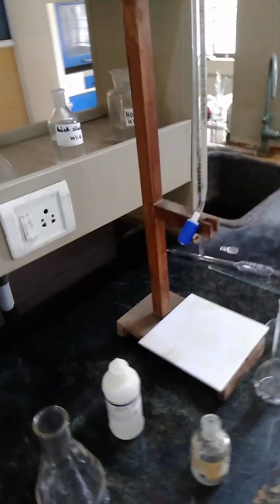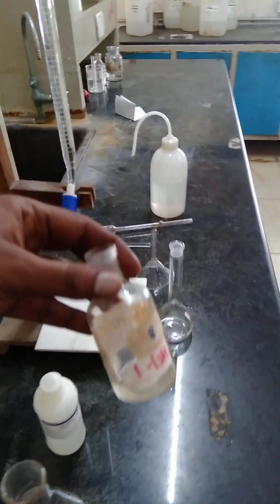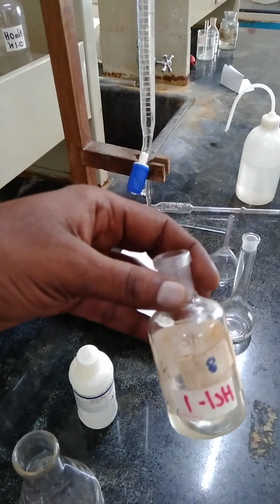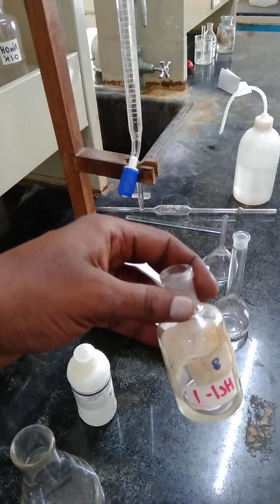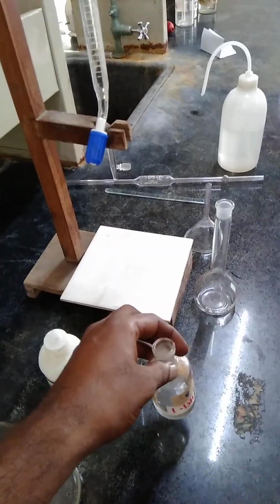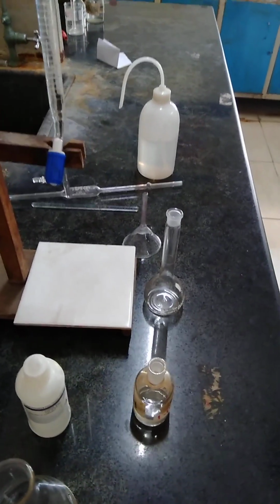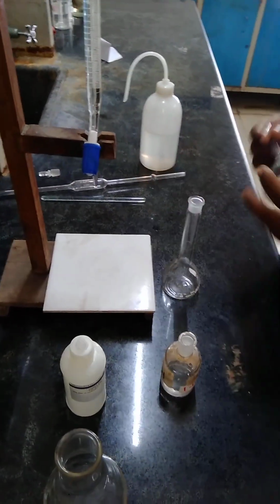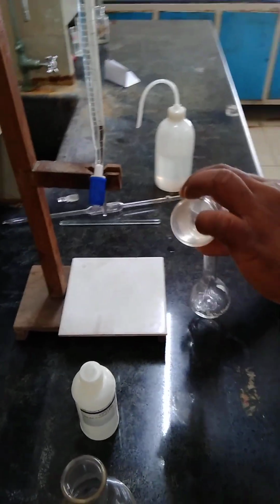Okay, we'll start. We are going to make up the sample. We take the sample which is given in bottle number 1. Each bottle number has a different normality, so you have to note down the bottle number first, then make up to the standard flask. Transfer the sample through the funnel into the standard flask.